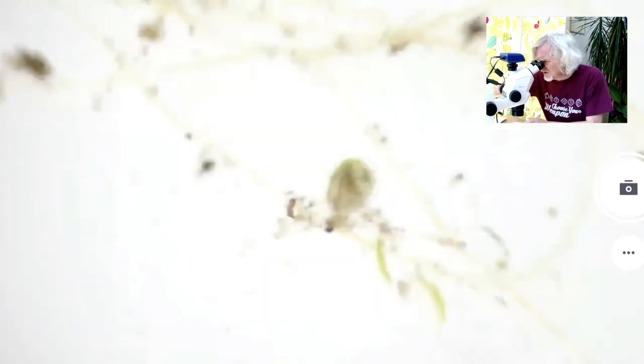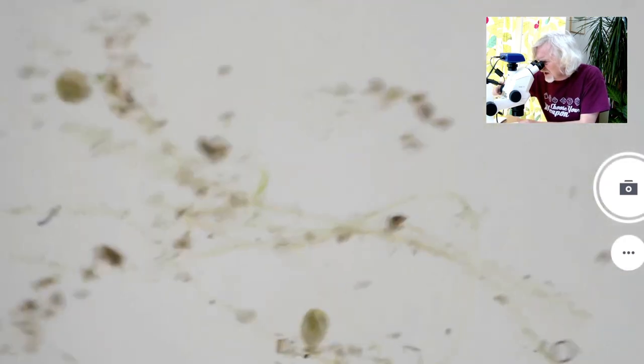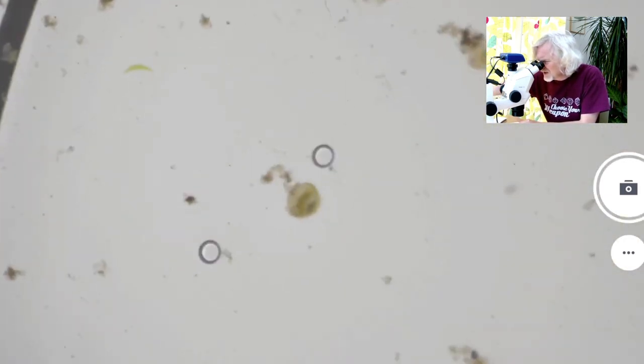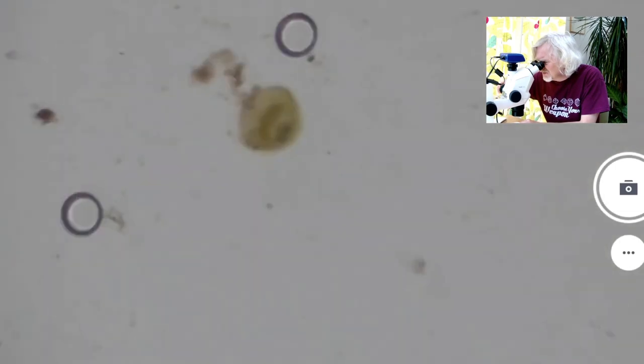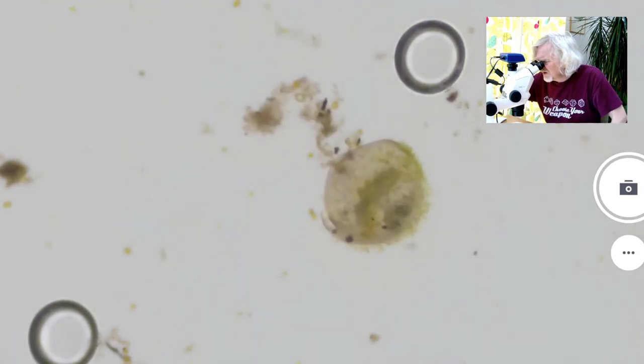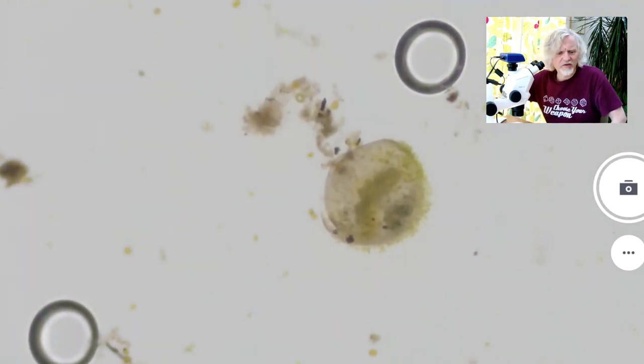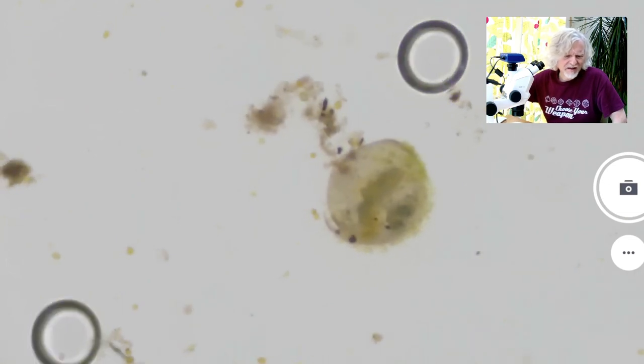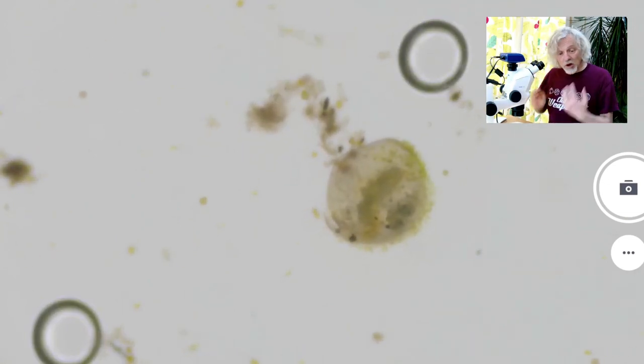There's another one over here. Let's show you. But this one, this one is conveniently, it might be dead. I won't be able to tell until I zoom in. There you go. No, it's not dead. It's still moving. You could just about see it moving there.